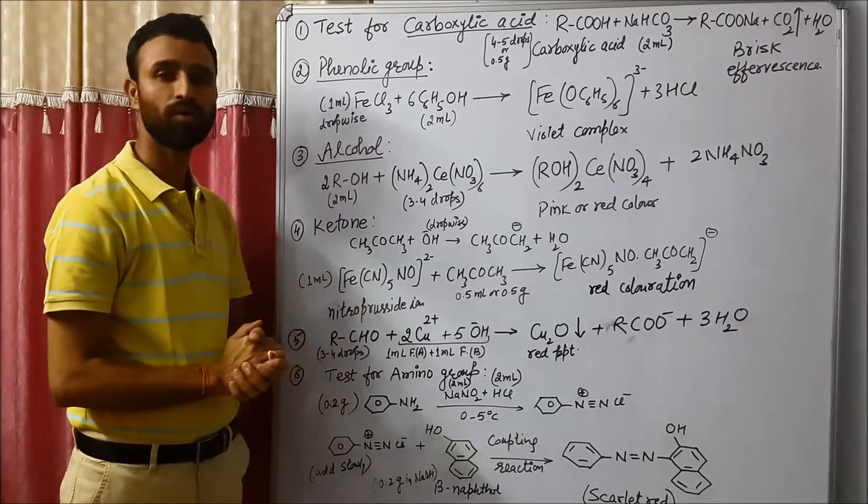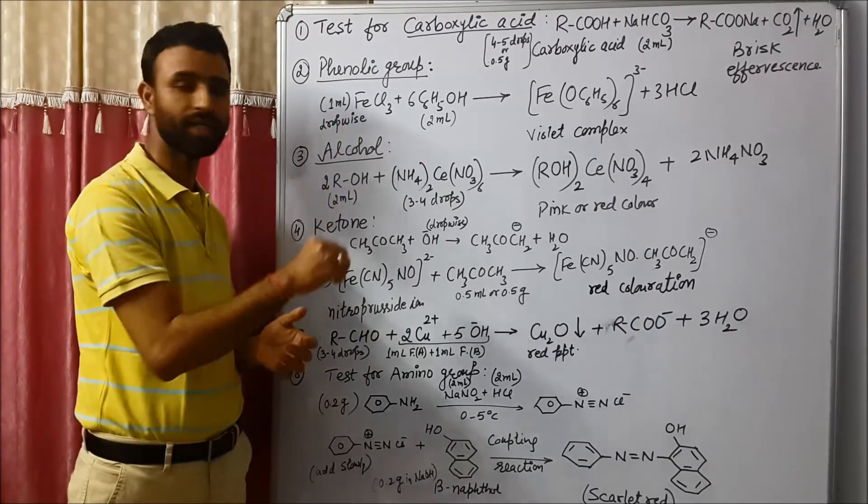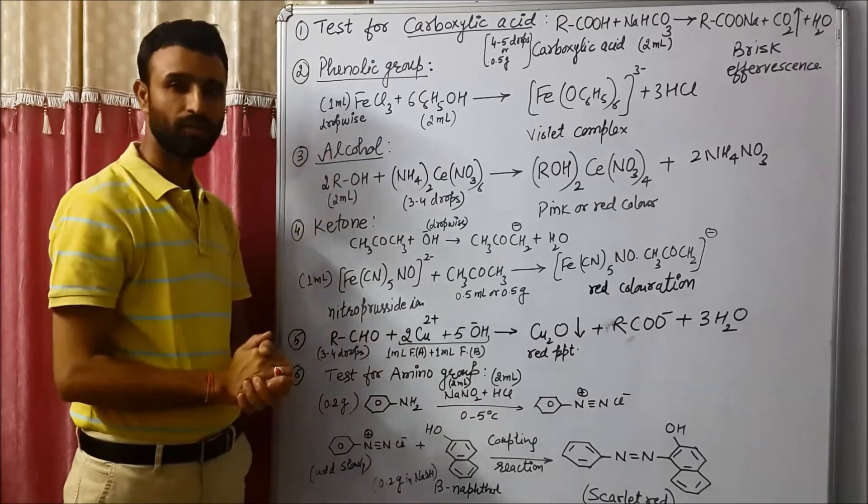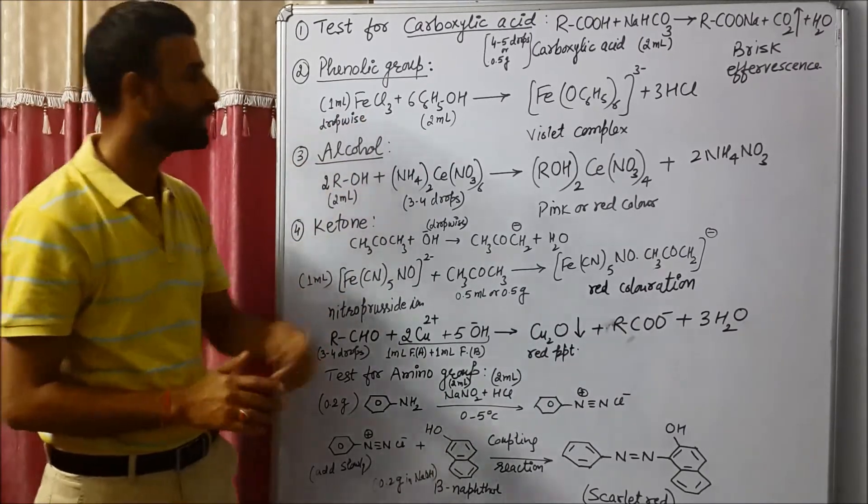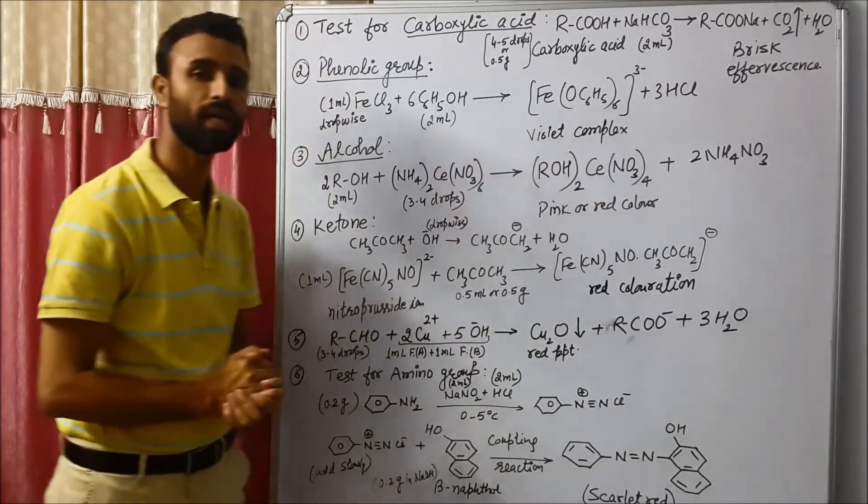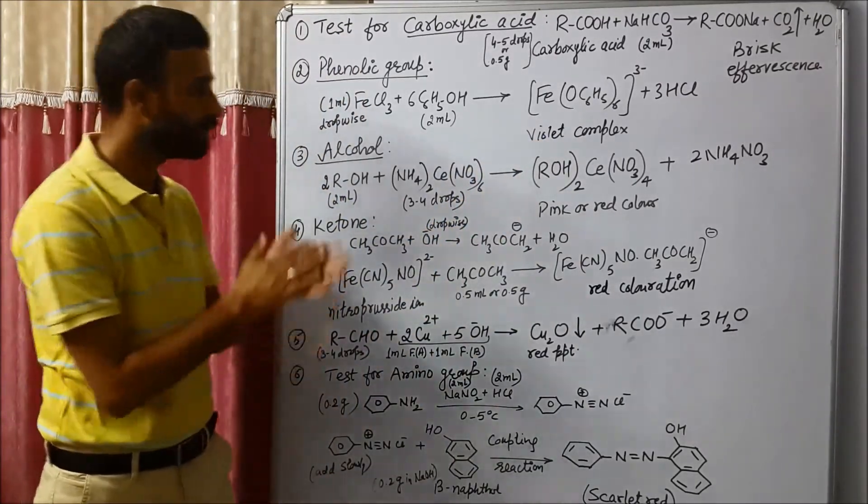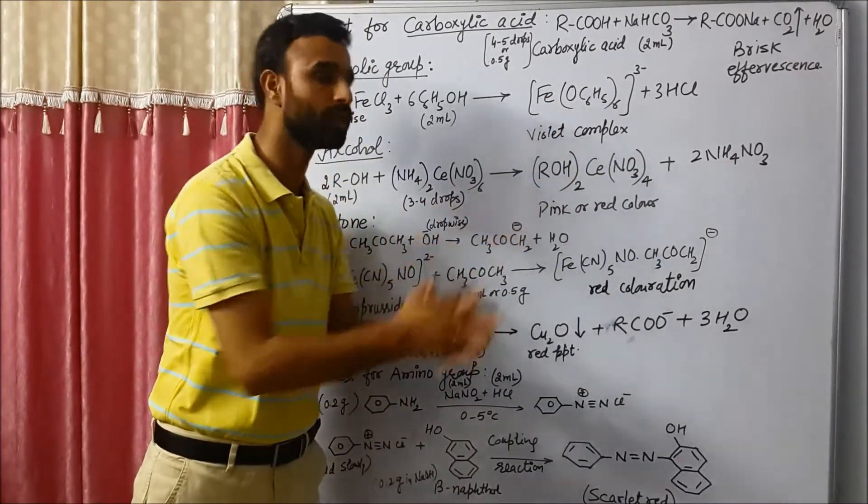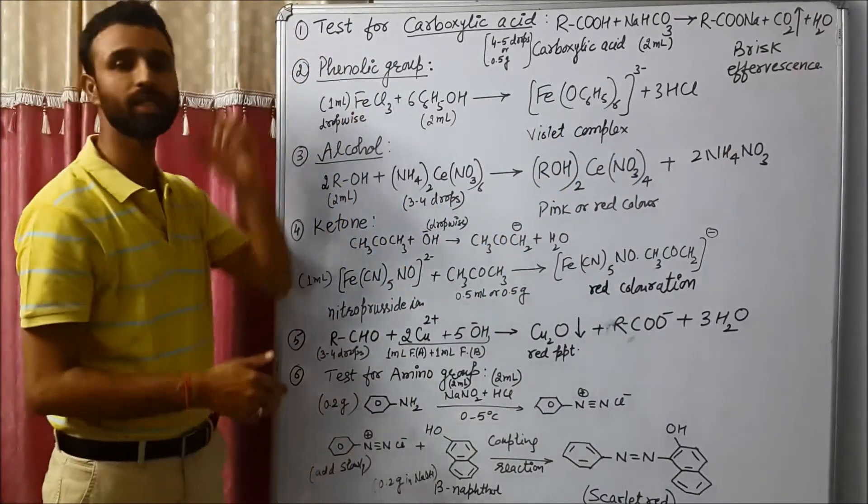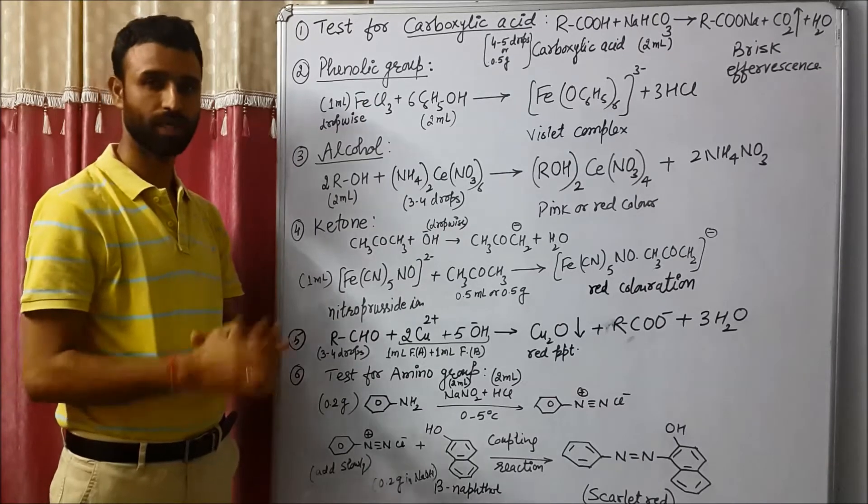So that reagent is given to you. And 1 ml of ferric chloride, but we add it drop-wise. When we add neutral ferric chloride drop-wise, we see the formation of violet complex. And if this violet colored complex is observed, that means phenolic group is present.